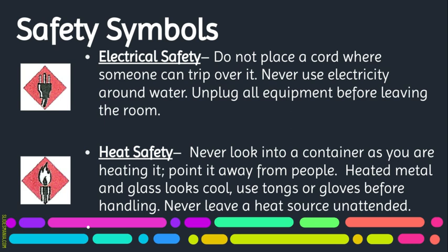You're never supposed to look into a container as you're heating it, and you're always supposed to point it away from people. If you cook, you know that when you heat things and you boil things, it bubbles and splatters. So we always need to make sure that that's not going to get on our eyes or on us.